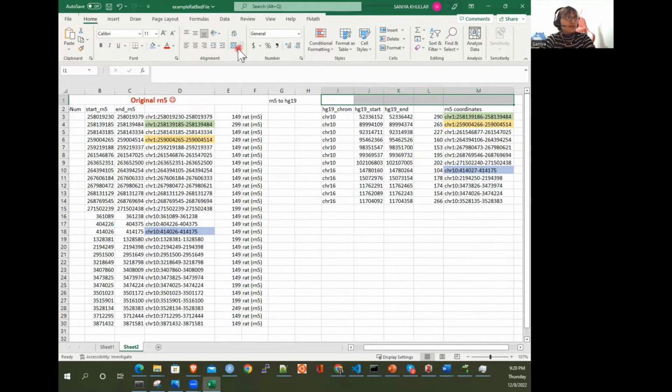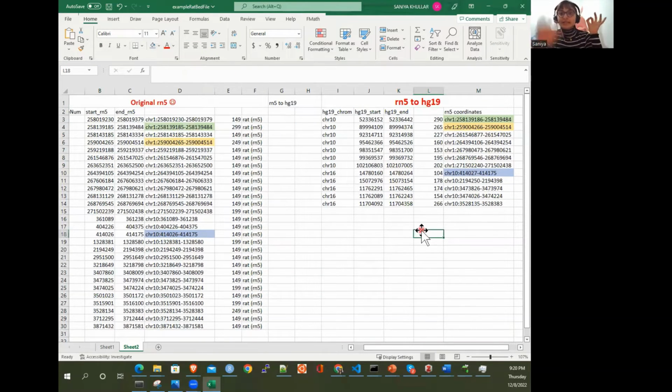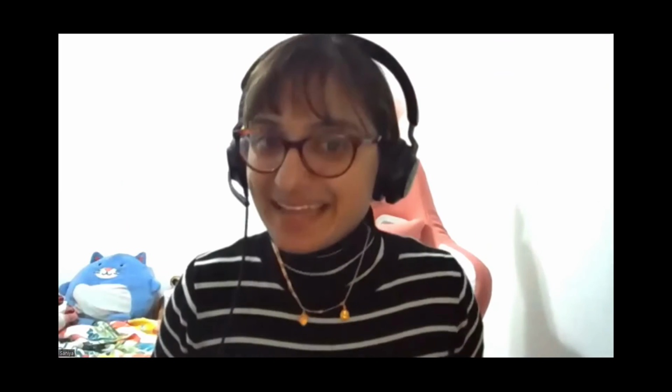This is the result of liftover from rn5 to hg19. Okay, so that's what this is over here. The thing I want to show you is that if we wanted to just use hg19, then that's fine, and we're done. Just get over the fact that 16 of those little regions did not map.